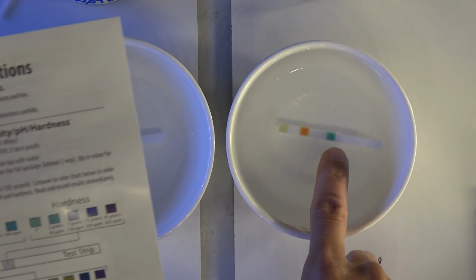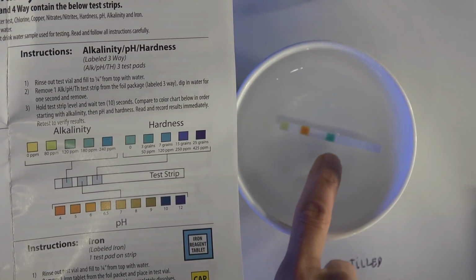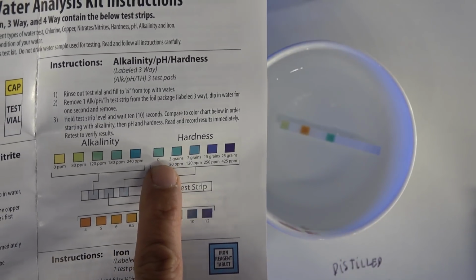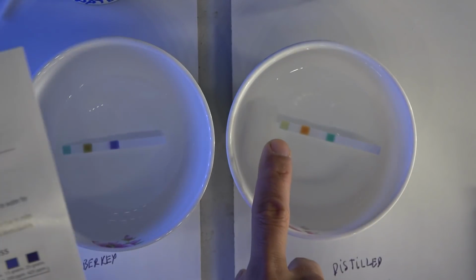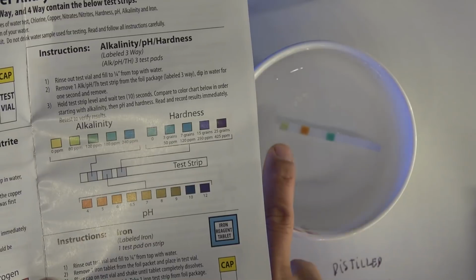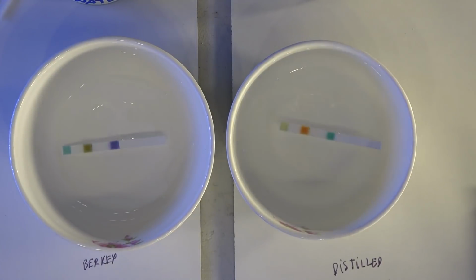The last one is the hardness. The hardness level, it looks like it's very pale blue, so it looks like 0 parts per million. So there's no more hardness, there's no more alkalinity. 0 hardness, 0 alkalinity, but slightly acidic on the distilled water. Right, so next we're going to take a look at the Berkey strip here.